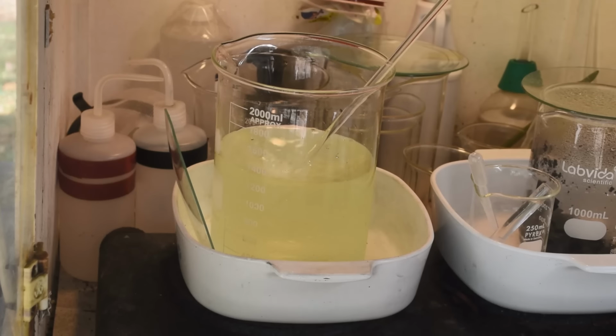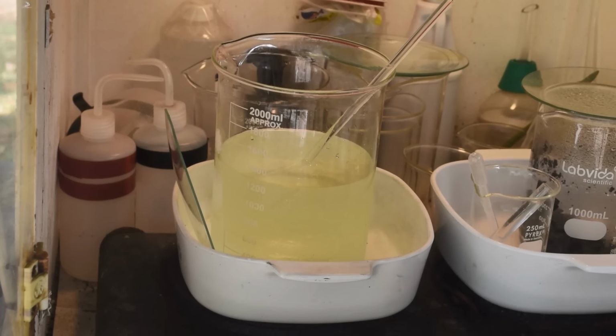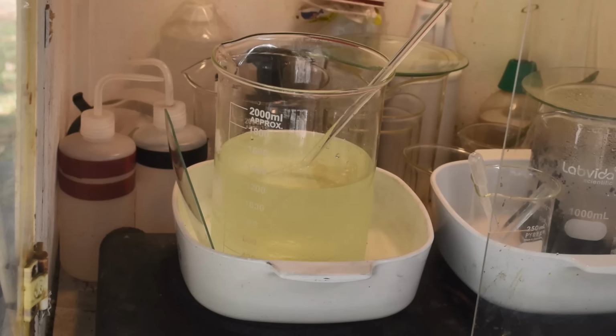There we go. Ooh, I forgot to turn the fume hood on. I just got a whiff of that sulfur dioxide. Wow. Not with it today. I can't believe I forgot to turn the fume hood on.